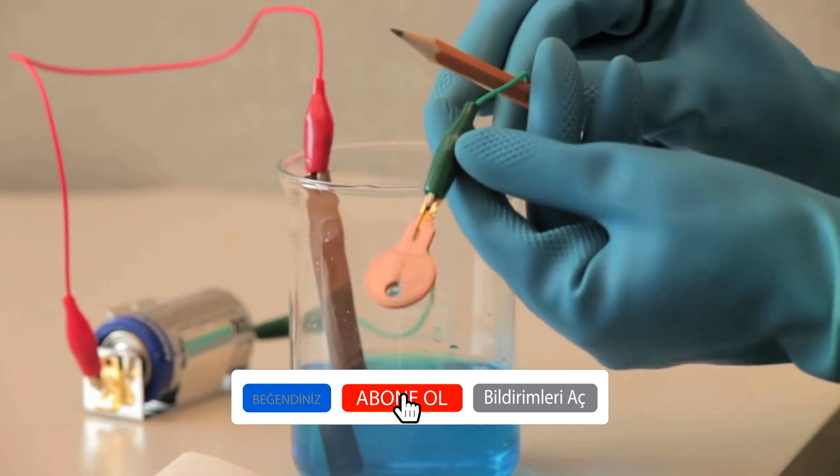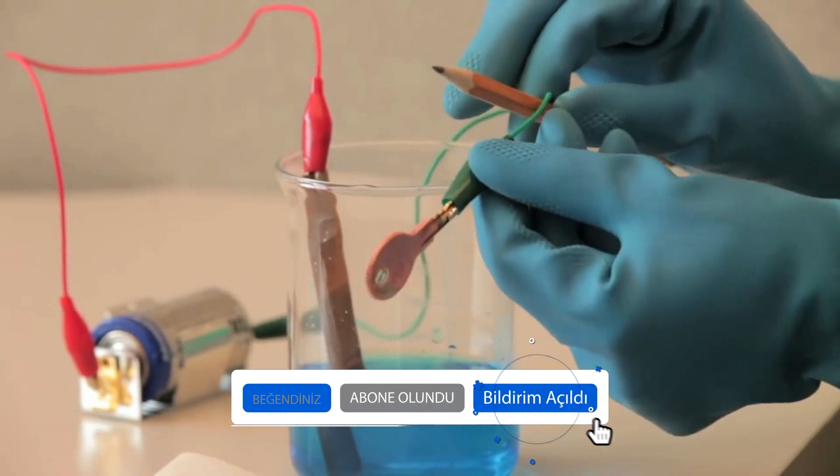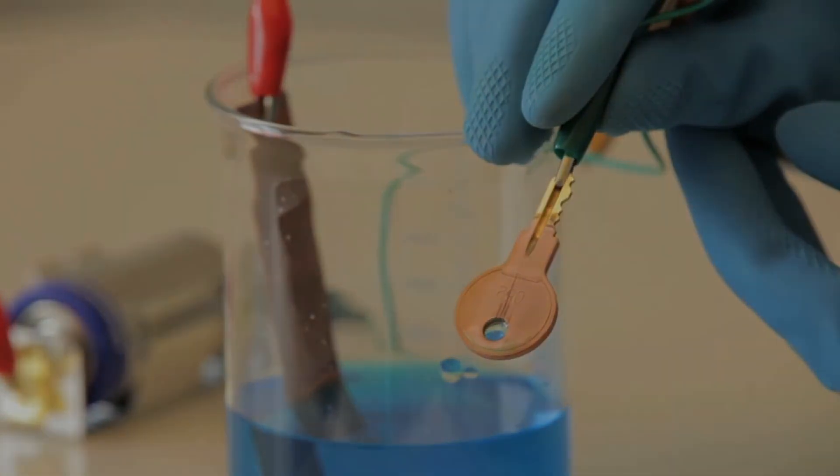After about 20 minutes, here is our result. While we don't get a high-quality finish like professional copper plating, you can see how the surface of the key is now coated with a layer of bright copper.